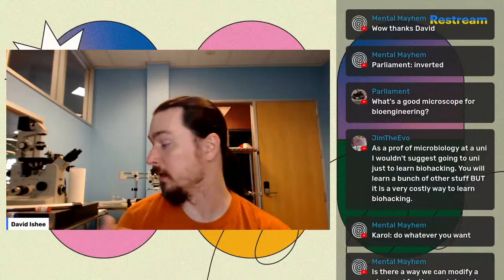What's a good microscope for bioengineering? So that's a question I get a lot. It depends on what you're doing. If you're working with bacteria, you almost never need a microscope. So if you're engineering bacteria or something like these plants, I don't use a microscope at all for these plants. I don't use a microscope for bacteria. Occasionally I'll use a microscope for some things.